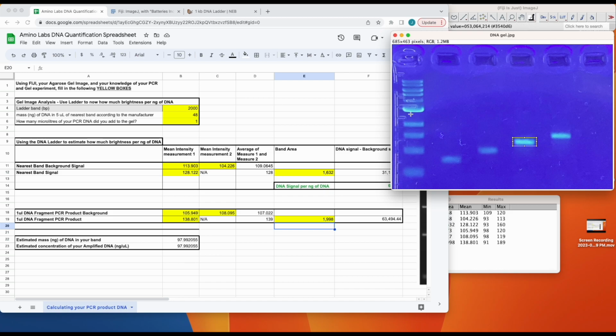And so I recommend you can go through and use these other bands. You could even do averaging of multiple measurements using different bands. And even check out the bright band. Again, bright bands, as they become saturated, the information and the calculation kind of gets thrown off. So maybe don't use this too often, but check it out, see what the output is, right?